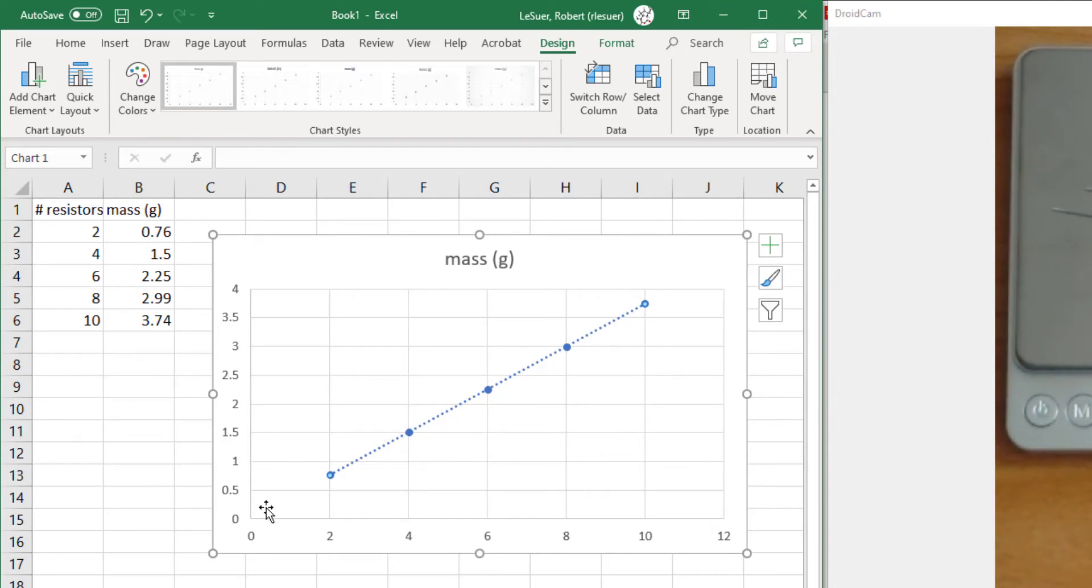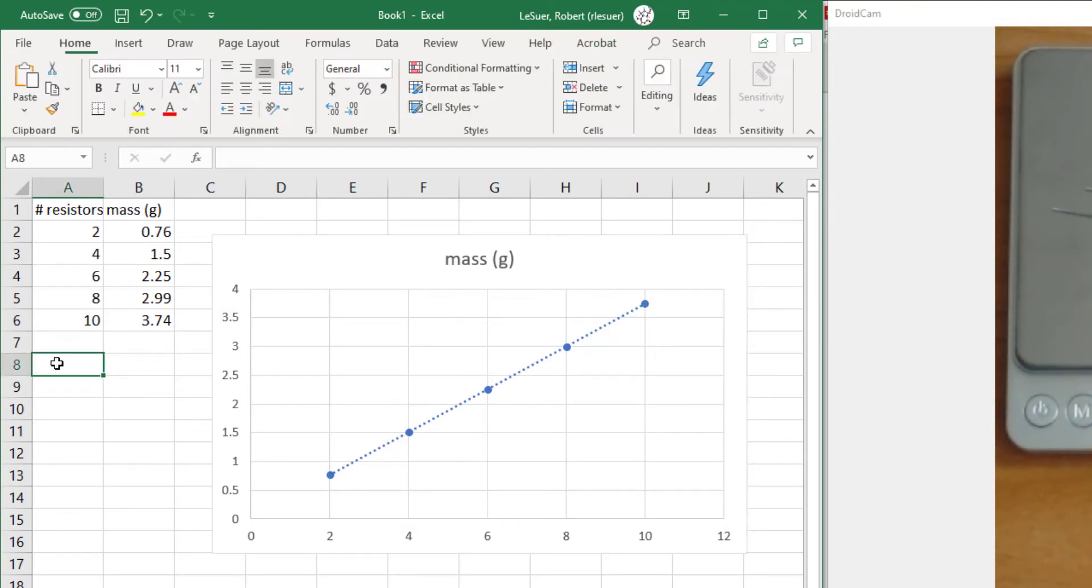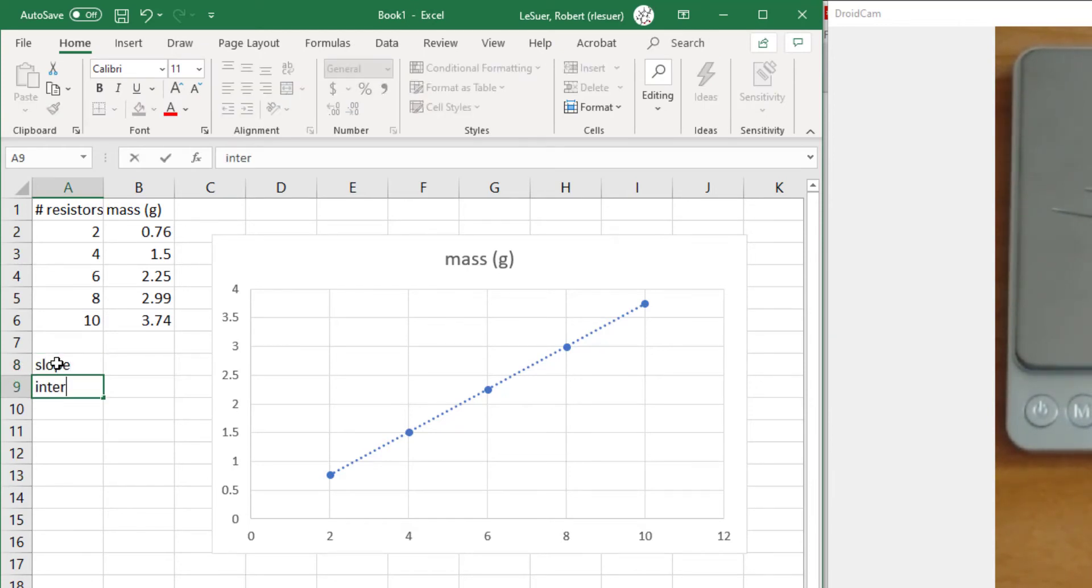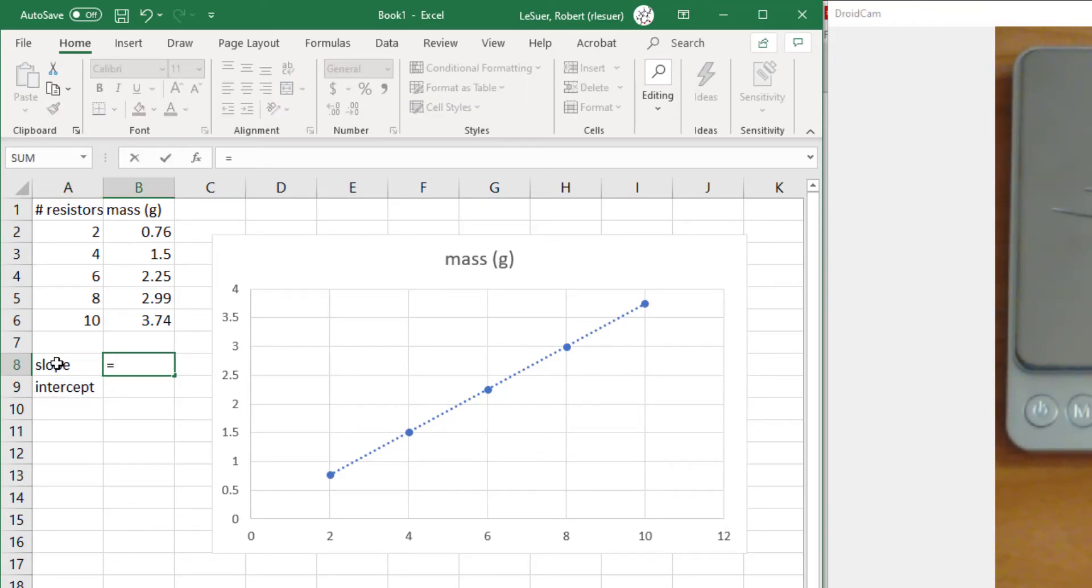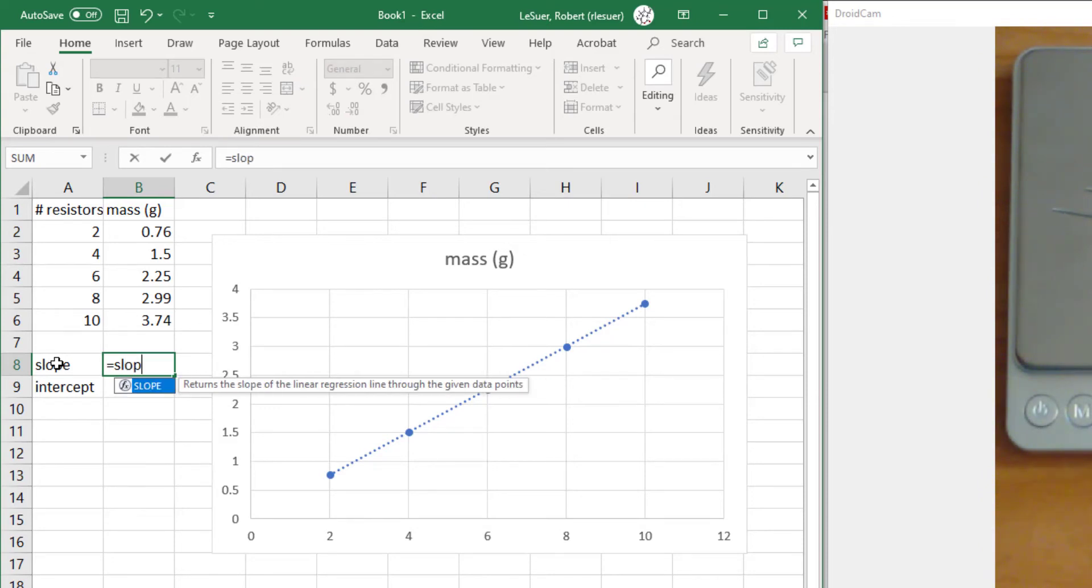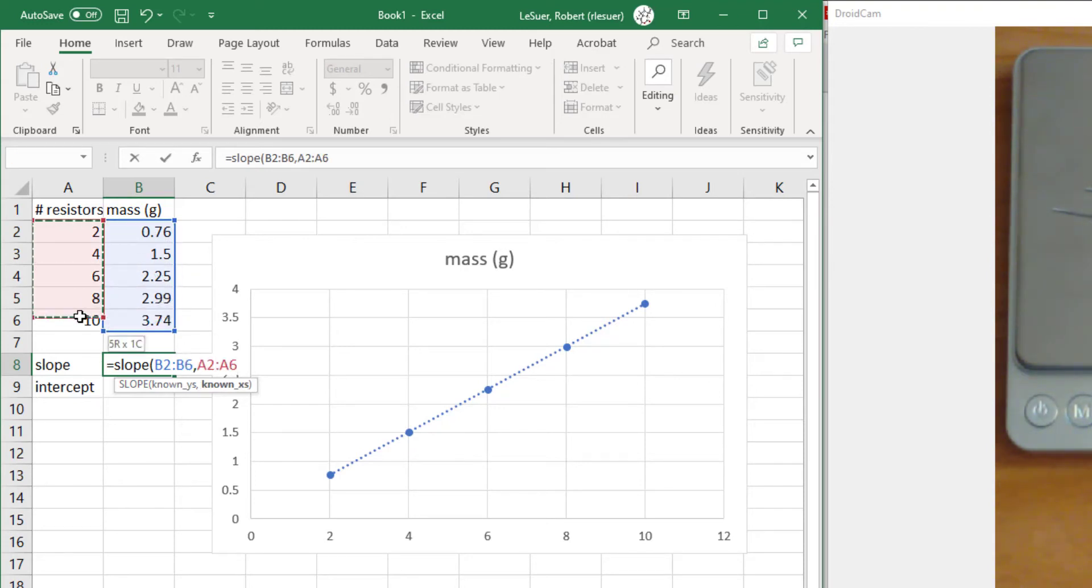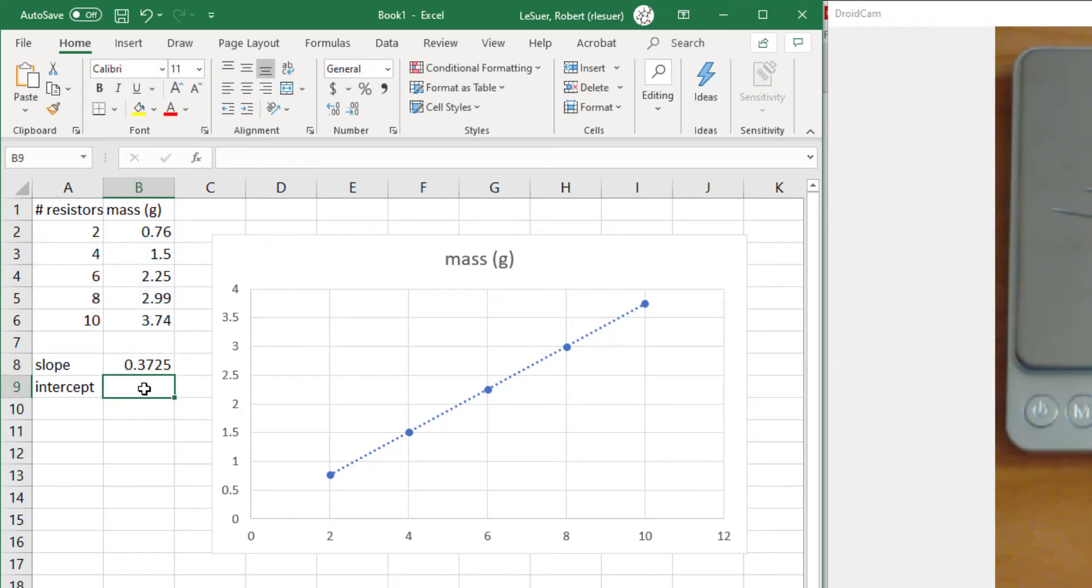Rather than get the slope and the intercept from the graph, I'm going to do that with two new Excel functions. We can get the slope by typing equals slope. The tricky part is it's asking for the known y values first. So I highlight all the y values, then the x values, close parentheses, and there's my slope.